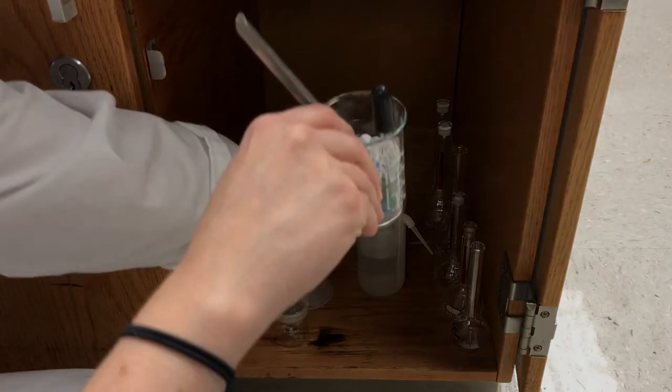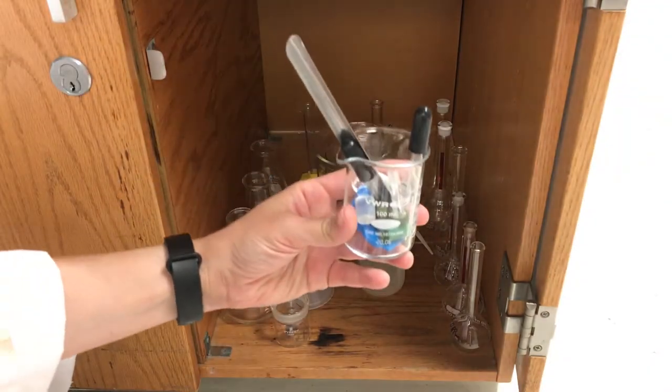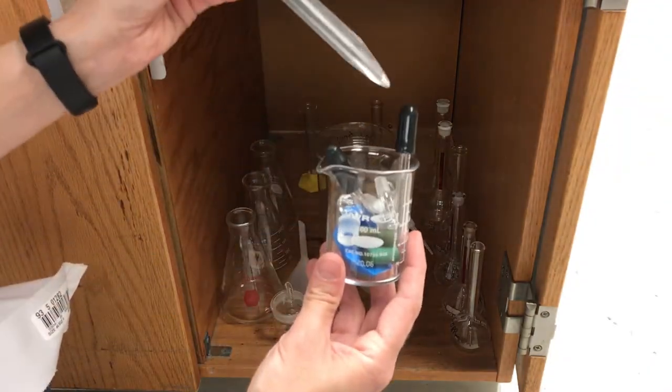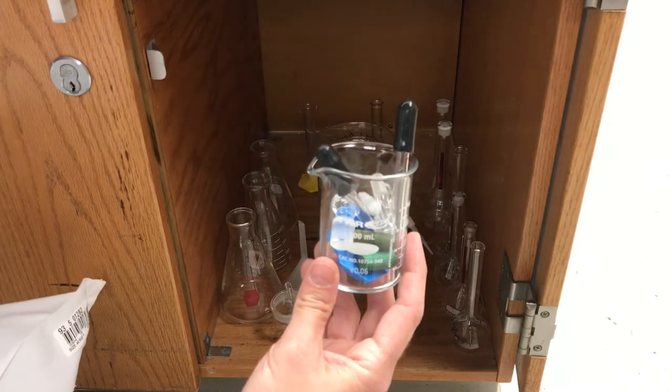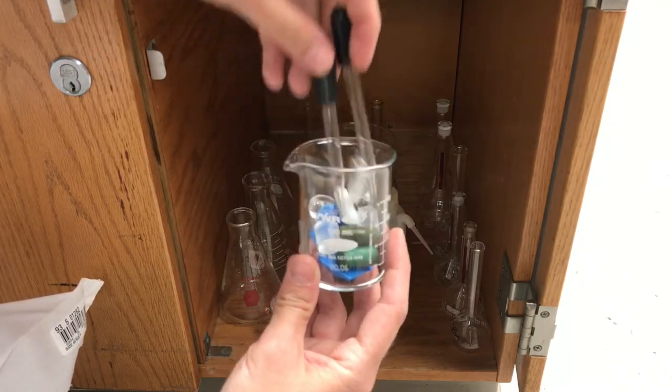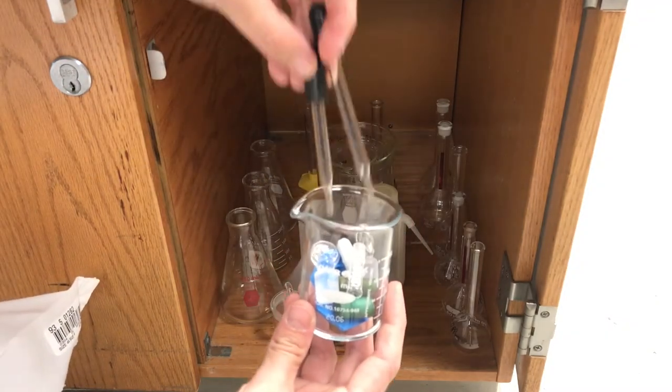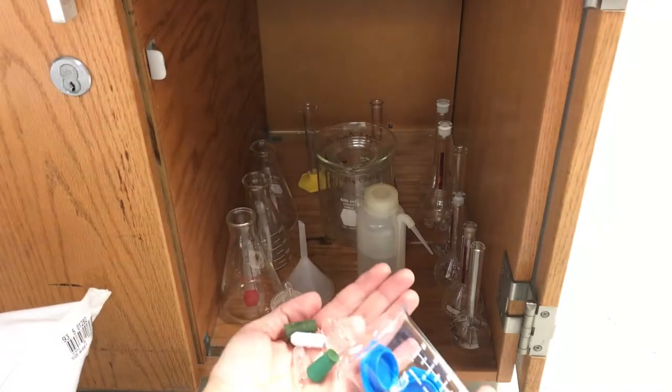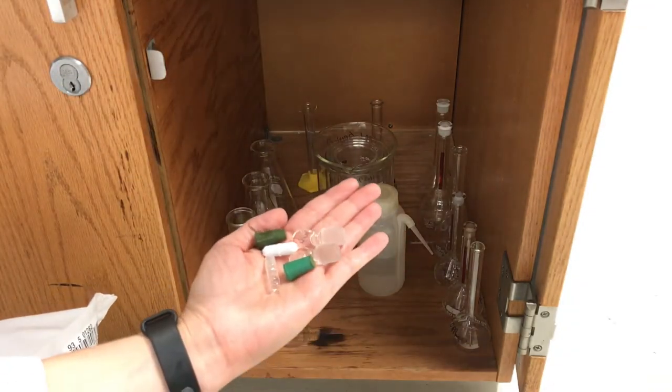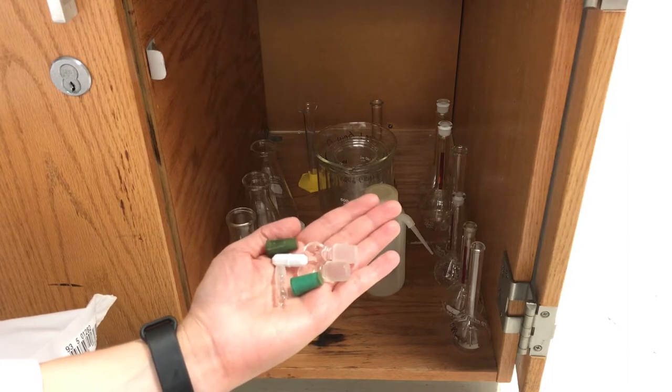And then often you'll find in the 100 milliliter beaker a few items such as a scoopula, maybe a spatula, two droppers, and a number of different stoppers that will go with some volumetric flasks.